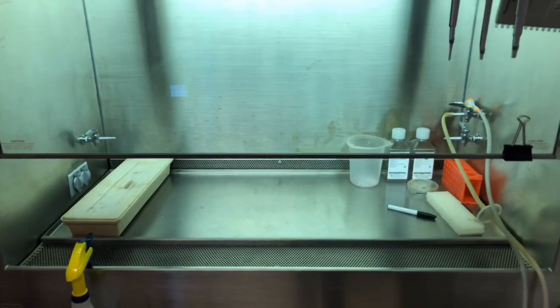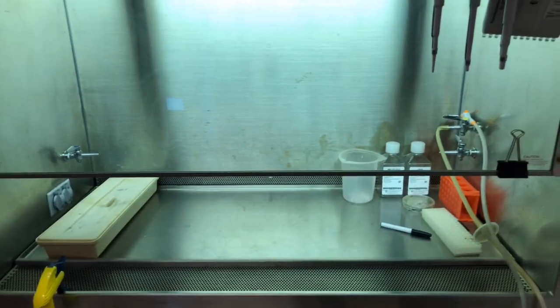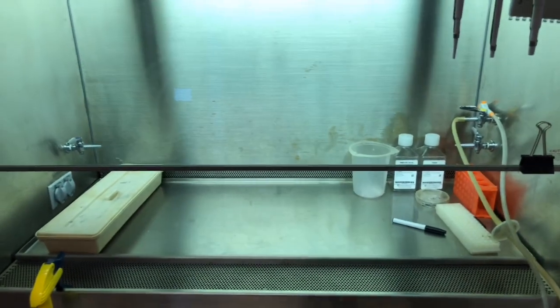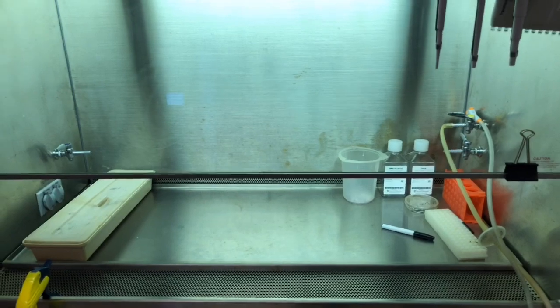And because I want this channel to be accessible to everyone, so anyone who is unaware of what a biosafety hood looks like, it's something like this. So we work within these kind of environments to make sure that viruses are only ever within that kind of environment where there's airflow being sucked out and through another HEPA filter, which gets rid of all the virus particles that may have been aerosolized. But again, we do everything we can to minimize the aerosolization.